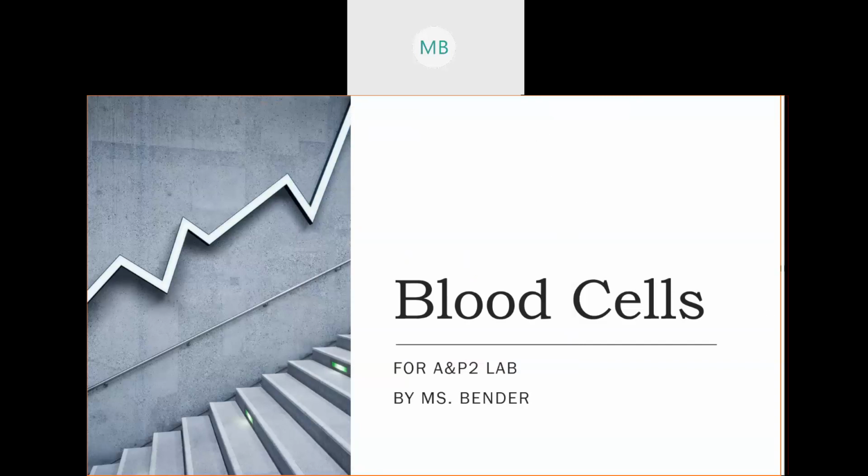Hello everybody. So for lab, I'm going to do a quick video on what to look for under a microscope so that you guys can identify the different blood cells that are on your lab list. This kind of goes hand in hand with your hands-on blood typing lab as well.